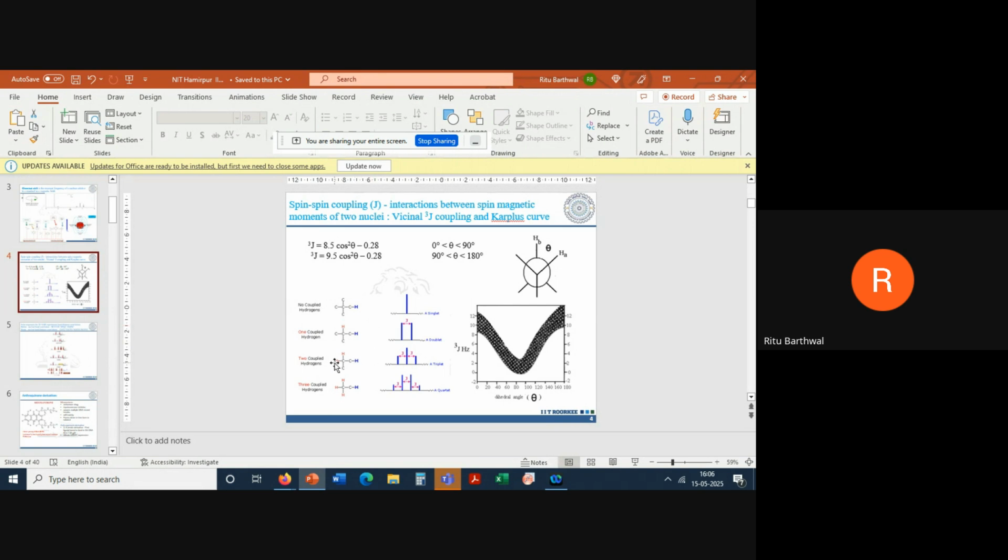Now this property has nothing to do with bond. For example, let us say this is a part of my G4 DNA, and I bring a ligand here. The ligand is sitting close by, having an H, close to this H in space. It is not bonded. This H belongs to the ligand, one molecule, and this H belongs to the quadruplex DNA.